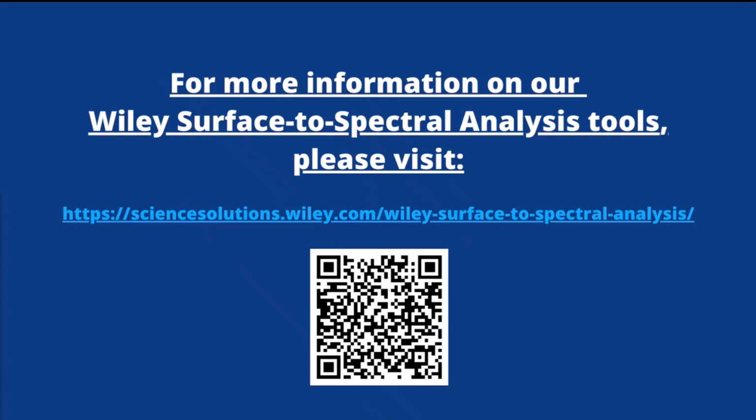How about this one? How does this work with KnowItAll exactly? So if surface-to-spectral analysis software detects KnowItAll software on the same computer, it will automatically display the KnowItAll wizard hat button.